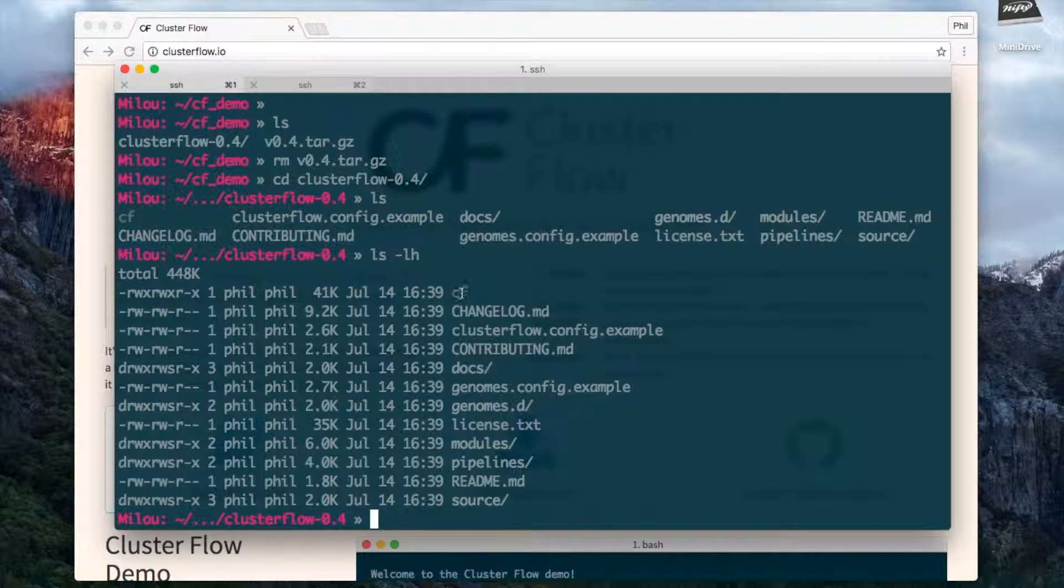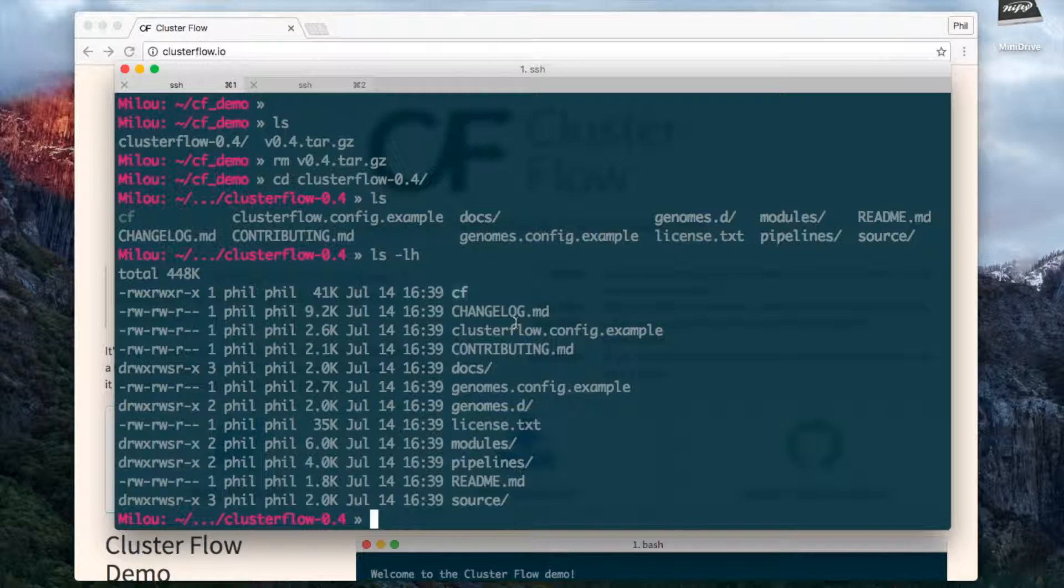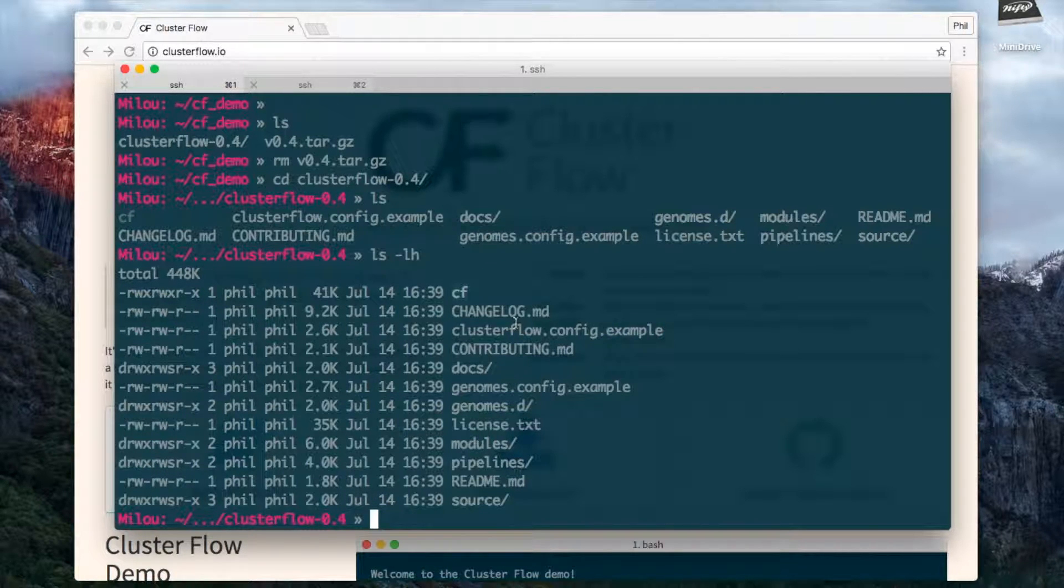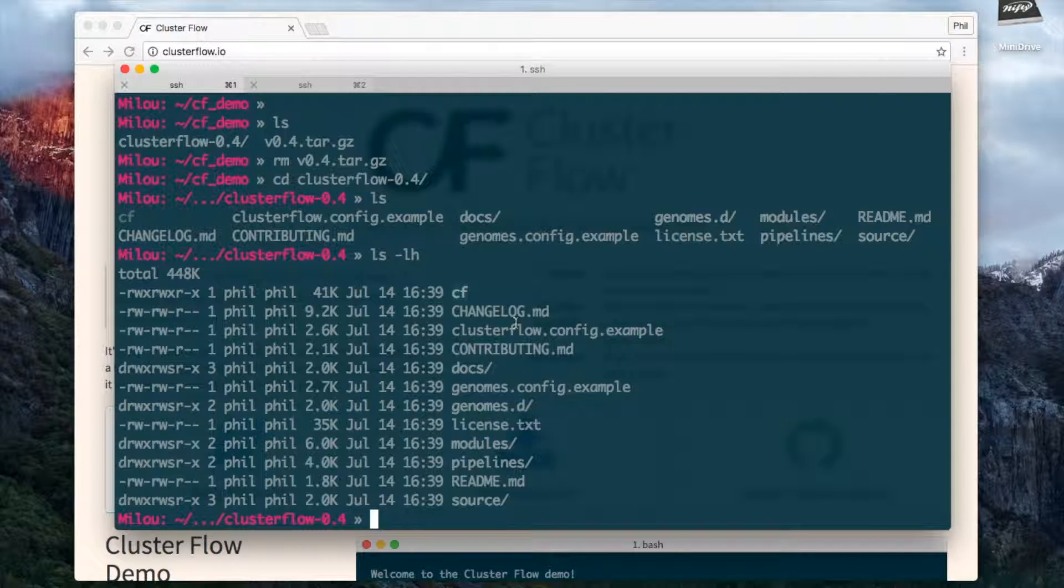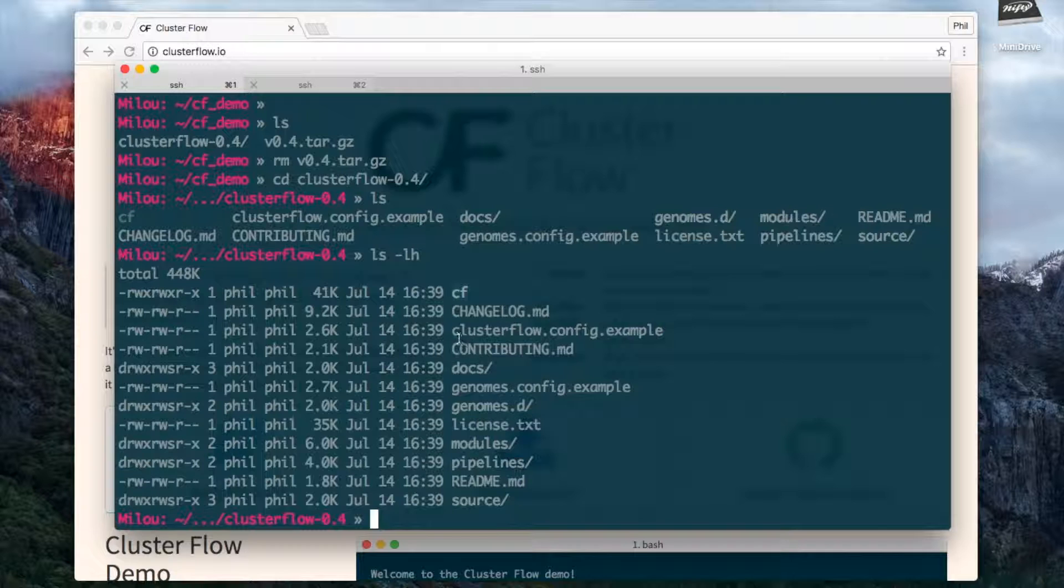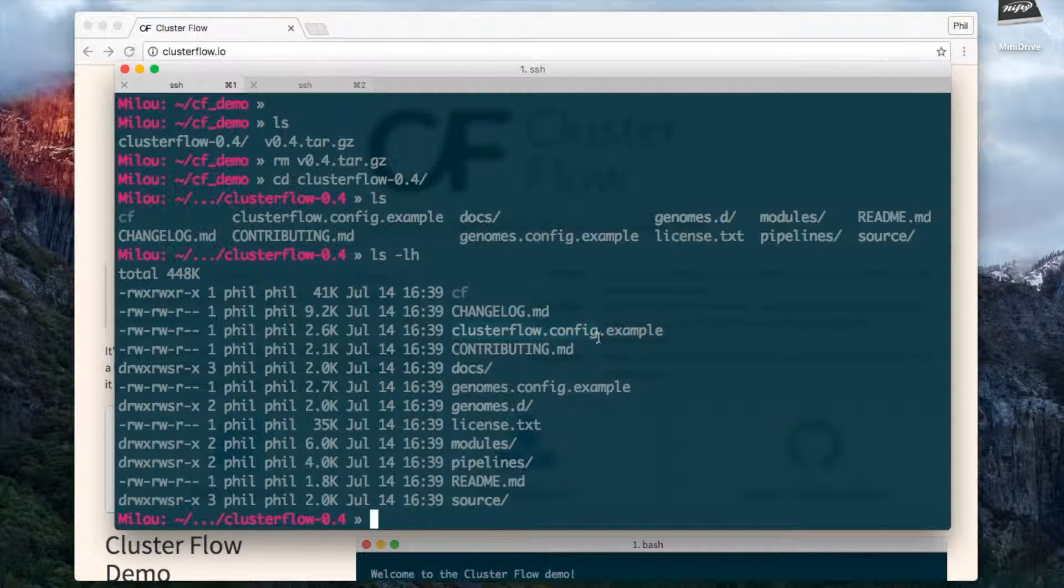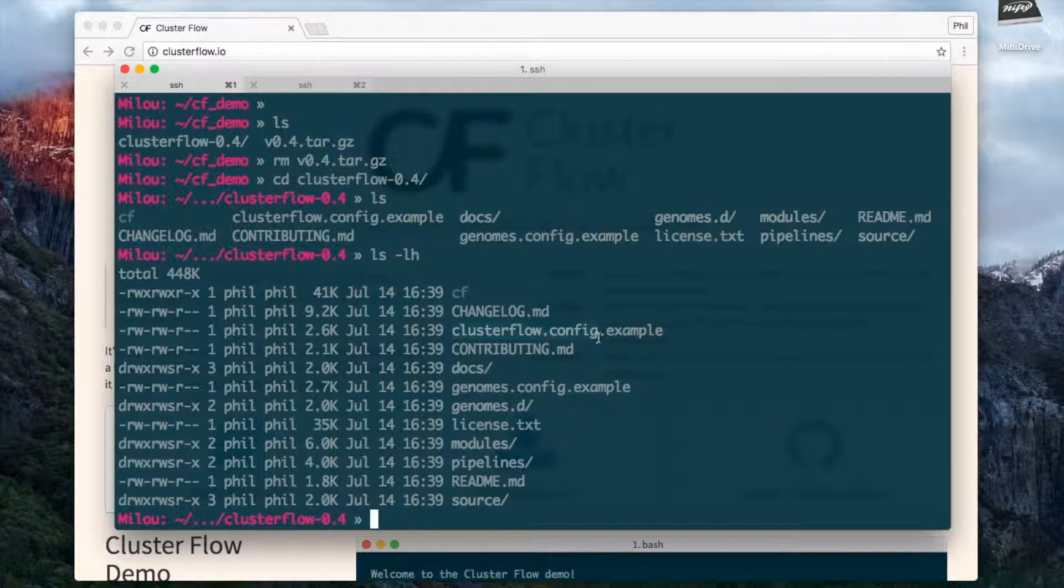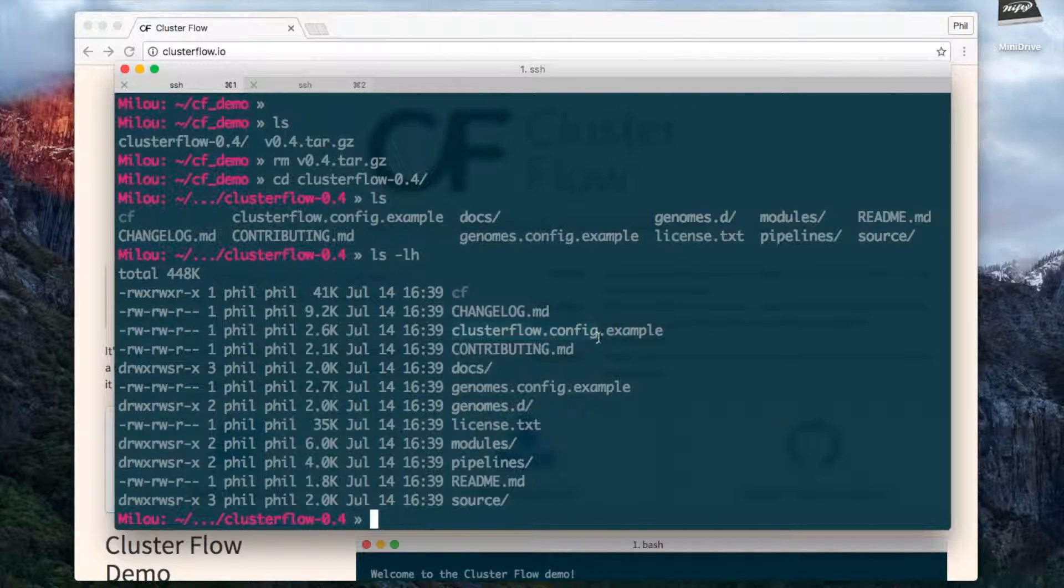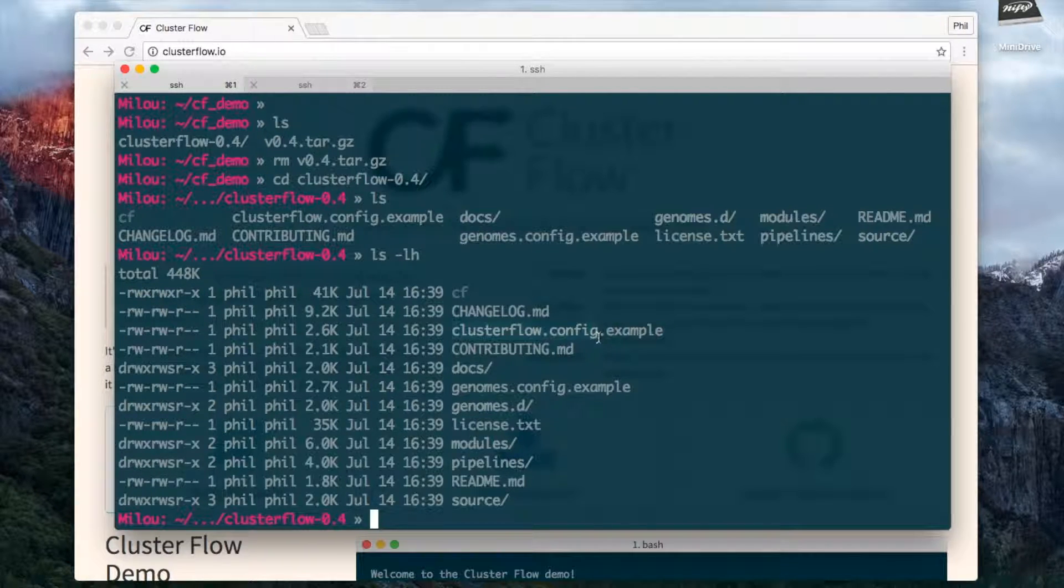This is the main program that we run, just called CF short for Clusterflow. Before we run it though, we need to set up a site-wide Clusterflow config file. Clusterflow is designed to work with config files on three different levels. It has this file created in the installation directory which is applied first for everybody who uses Clusterflow. Then it's expected that a user can have their own configuration file in their home directory, and finally there can be a configuration file in the working directory at any time.